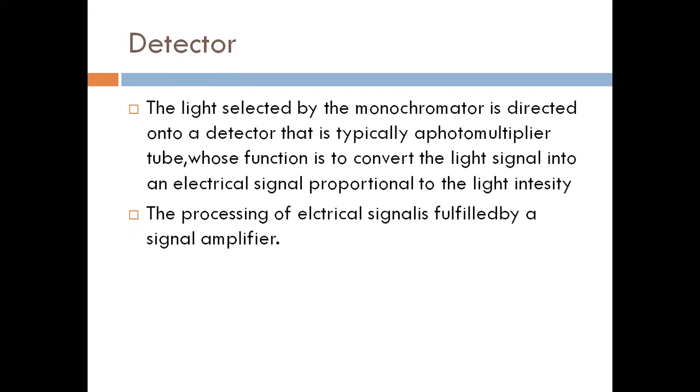Detectors mostly used in old equipment are photomultiplier tubes. With modern equipment, they are being substituted by a system based on a solid state detector type (CCD). They are similar to digital cameras. So modern CCDs have 1 to 50 million pixels, each one of them working as an individual detector.